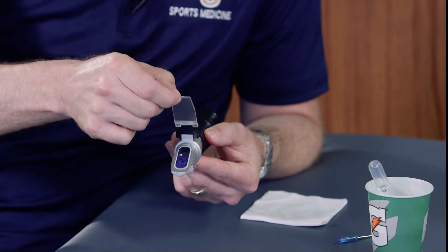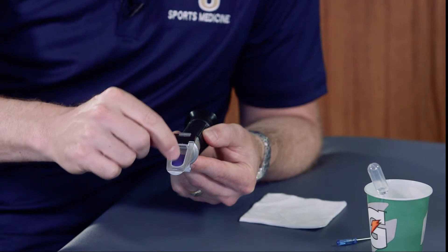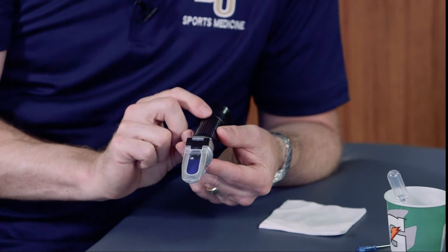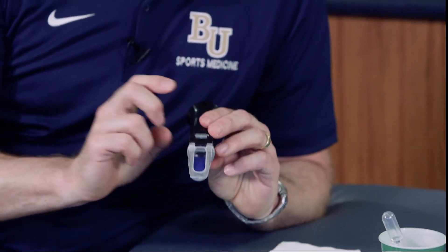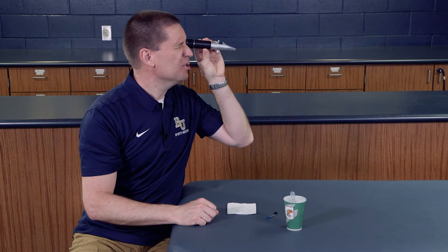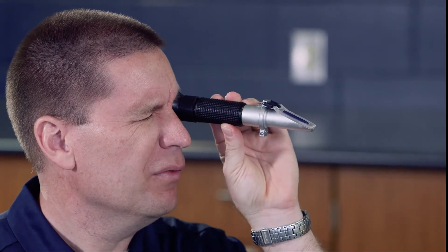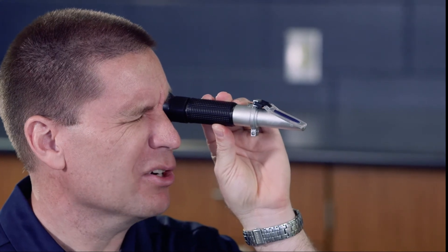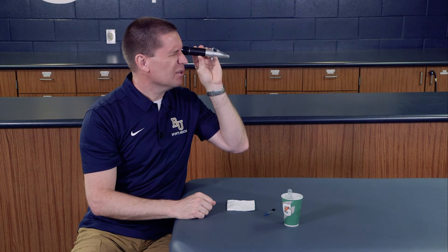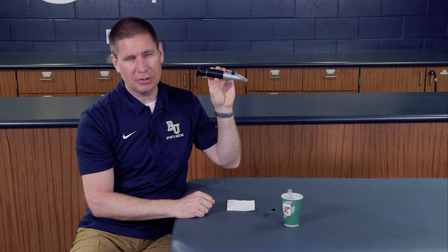I'm going to bring this cover right over the top, which spreads and separates the urine directly over the prism. This allows me to view and look for the specific gravity. I'll look inside of the prism, kind of like you would a microscope, and you can see the reading and numbers inside that give us the specific gravity number.